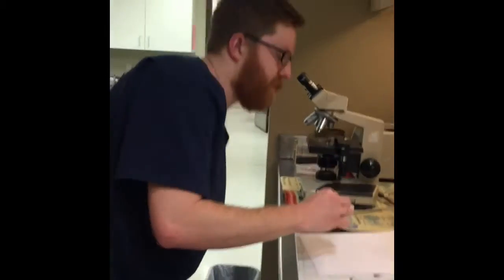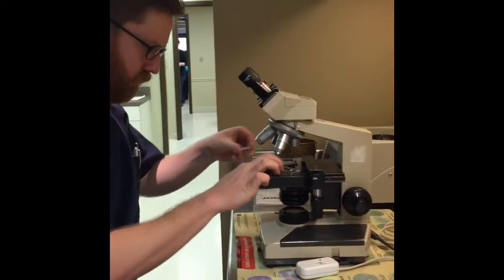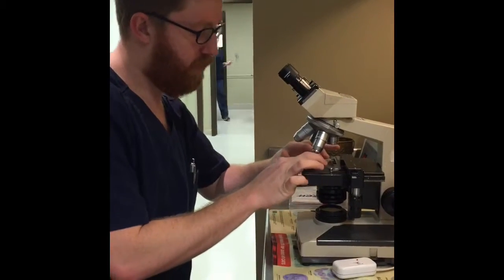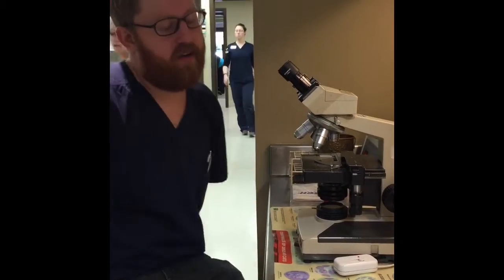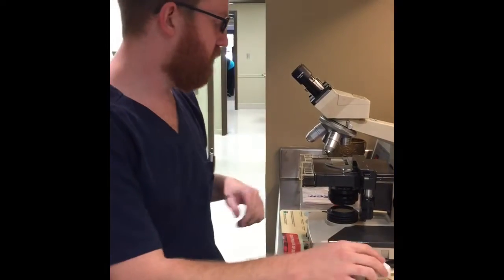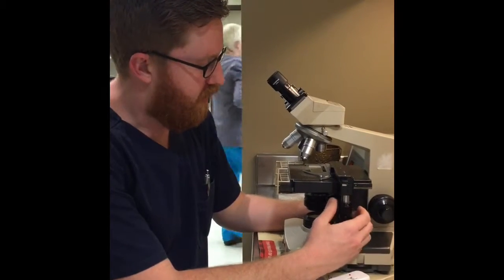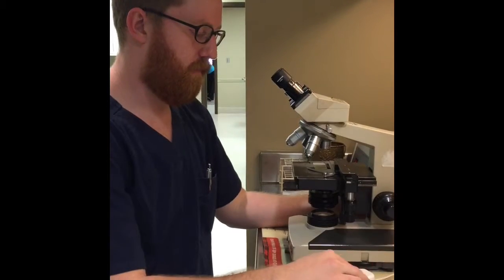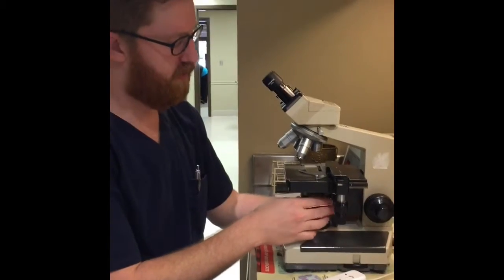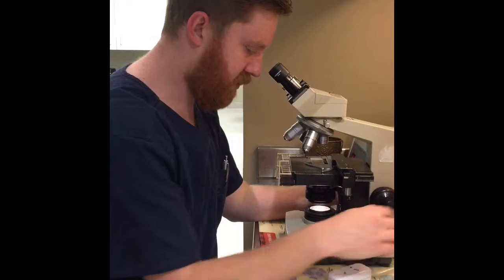Alright, we're going to come over to the microscope. I'm going to work my way up in magnification, but on 10x I'm going to be looking for crystals and cast. On 40x I'm going to be looking at red blood cells, white blood cells, or there's always a chance that I don't see any of that, so hopefully that's the case considering it's my dog.